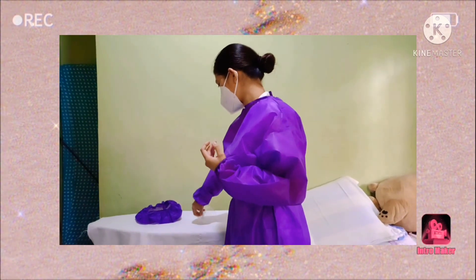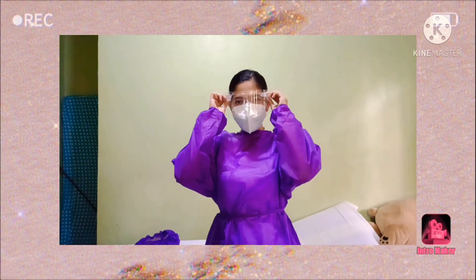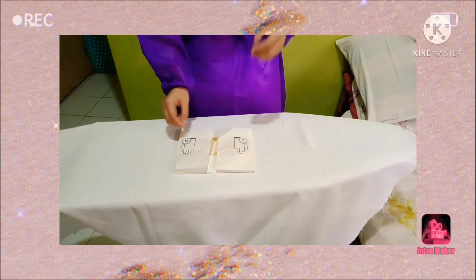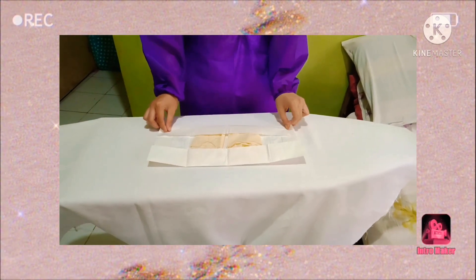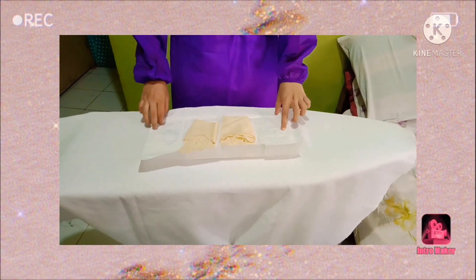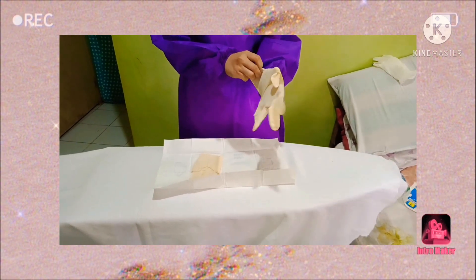Put on face shield to provide full face coverage and excellent protection for the eyes. Next, put on gloves. Gloves should cover the cuff or wrist of the gown. This protects and guards the hands from touching anything that may cause disease or harm to one's health.